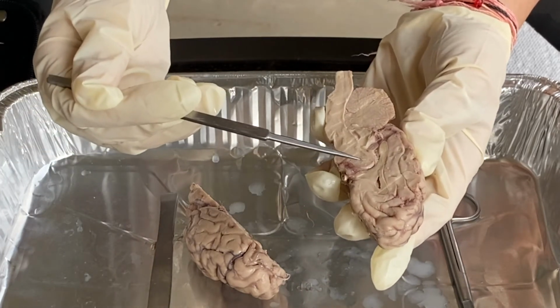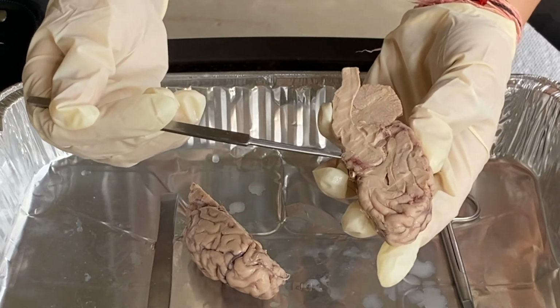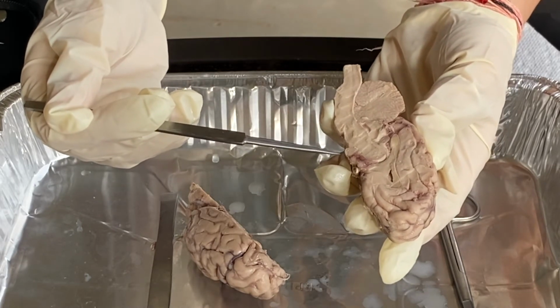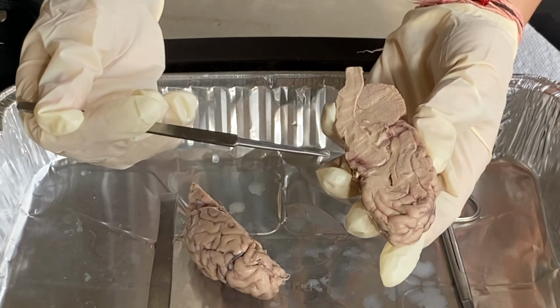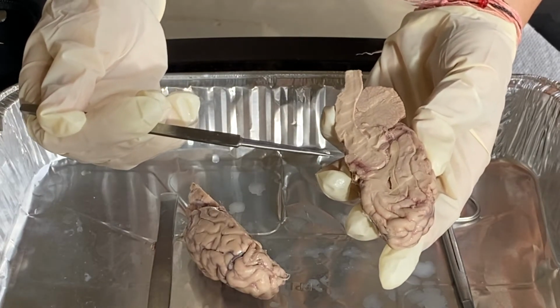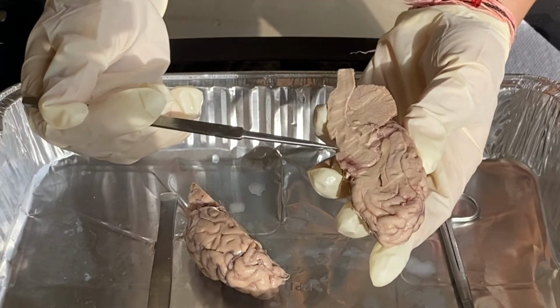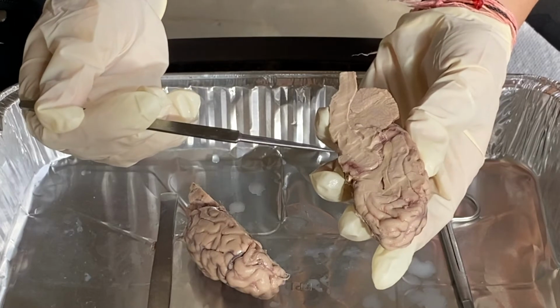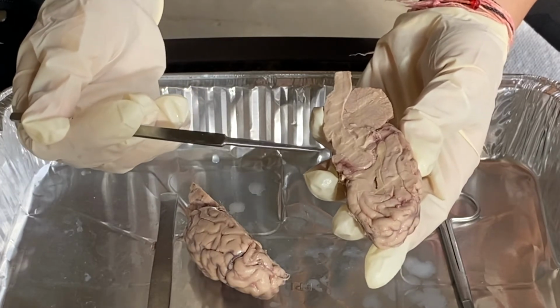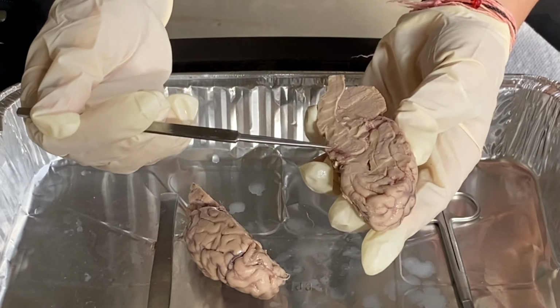Right below the thalamus is your hypothalamus, and the hypothalamus basically releases hormones, regulates body temperature, and maintains physiological cycles. It controls your appetite, manages sexual behavior, regulates emotional responses, and also modulates your endocrine system because it has connections with the pituitary gland.